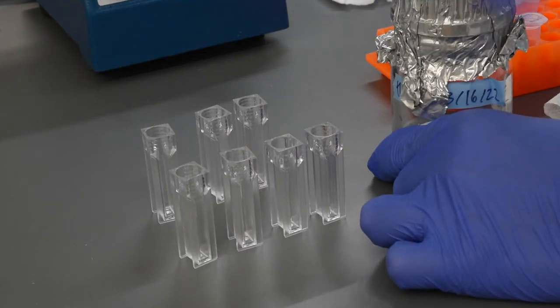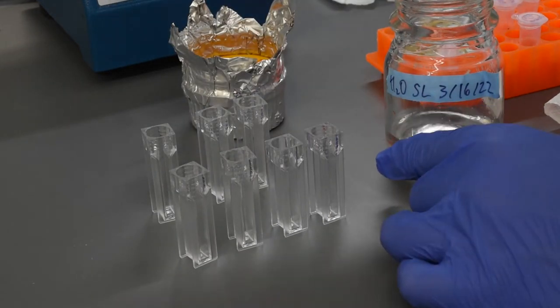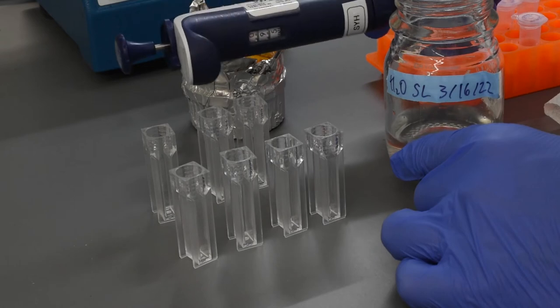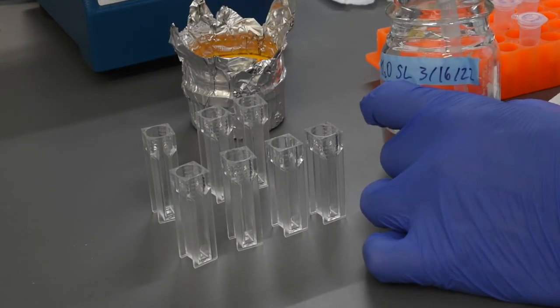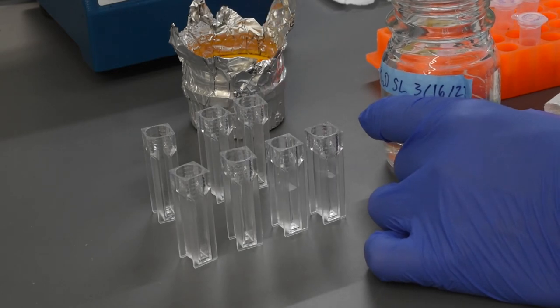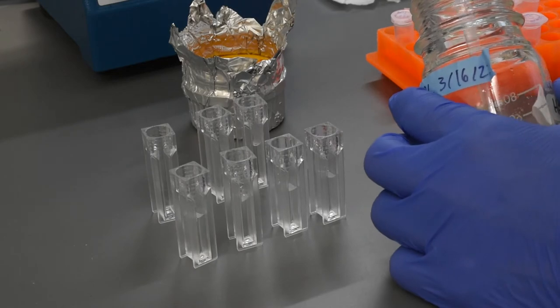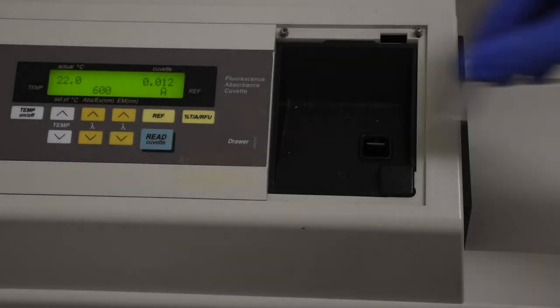Next, we are going to measure the OD600 of the cell suspensions. I use a 1 to 20 dilution to do this. Fill 1 centimeter polystyrene cuvettes with 950 microliters of water. Make sure your spectrophotometer has had time to turn on and warm up its lamp. Blank the spectrophotometer with the water-filled cuvette.